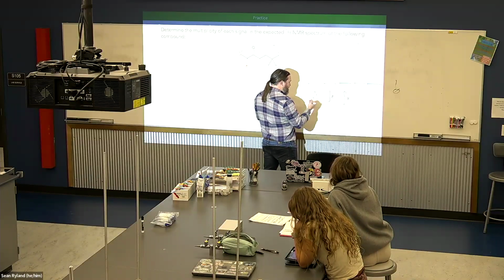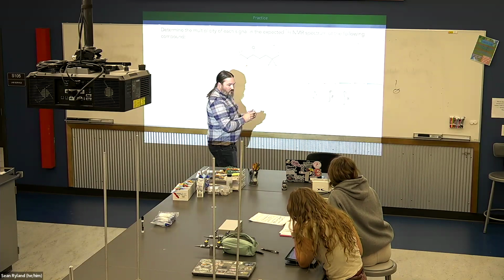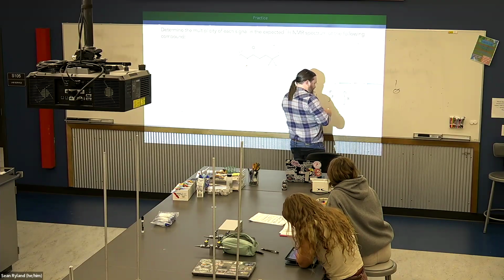The orange one should be an integral of 6, so 3 times bigger than that.